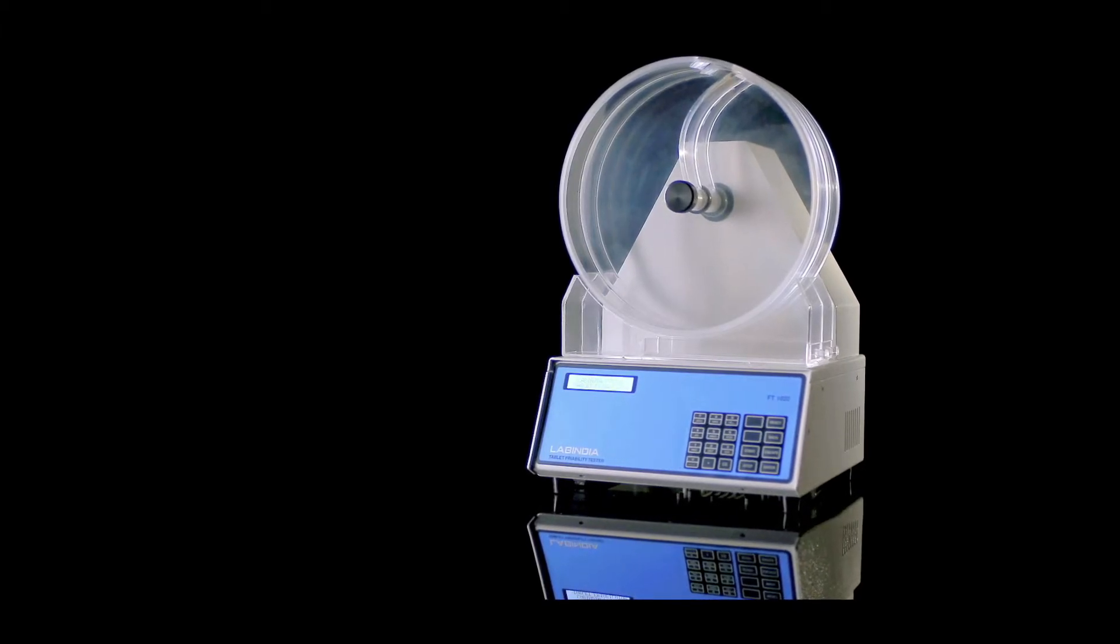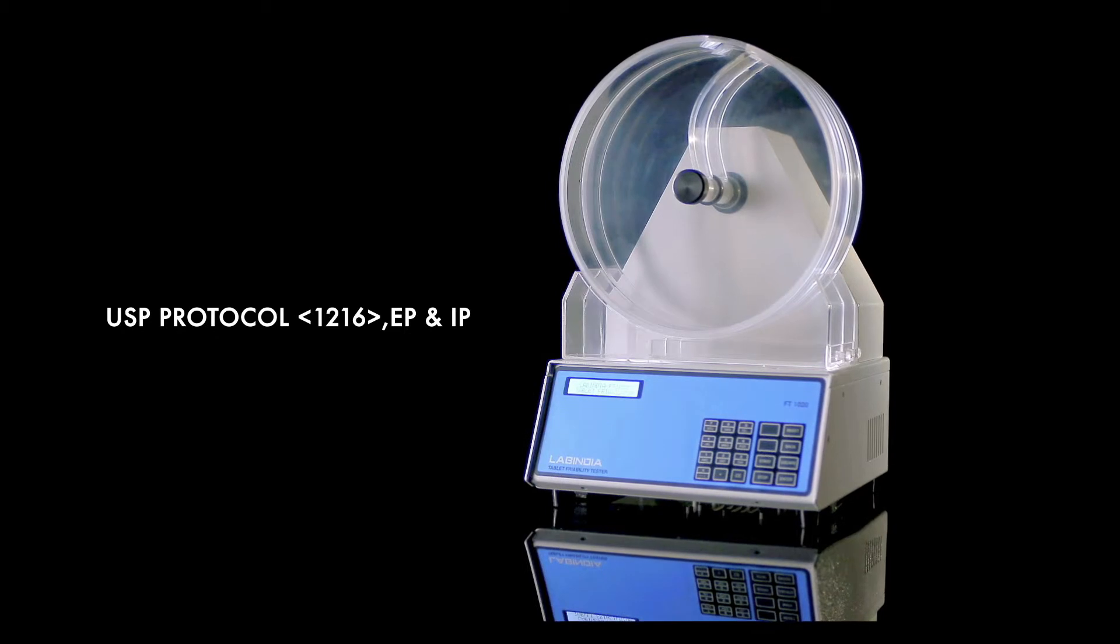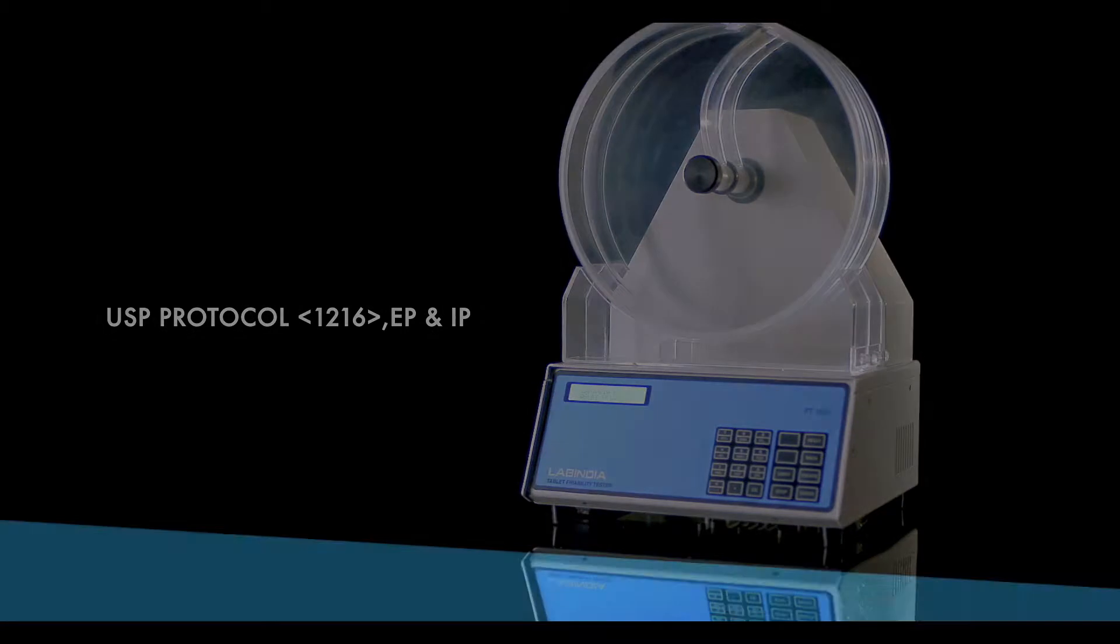The tablet friability tester from Labindia complies to all pharmacopoeia. Earning the trust of many successful pharma MNCs globally, it's your turn now.